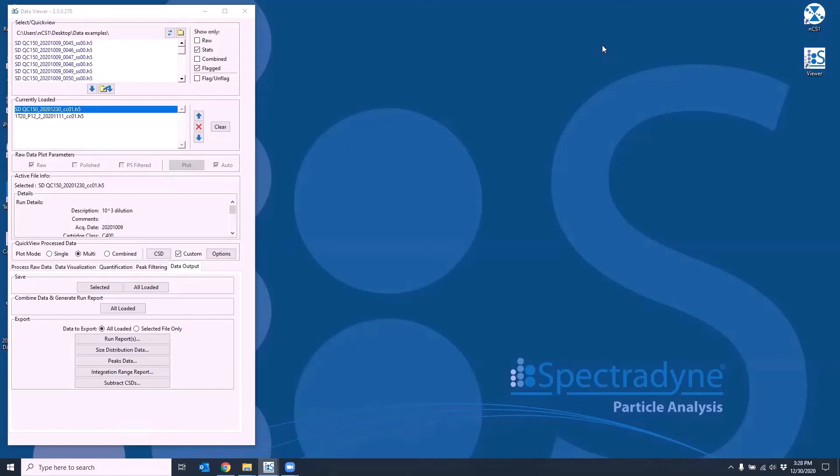The last option under export is subtract CSDs. This option allows for subtracting one CSD from another and this is very useful if we have a blank measurement that we want to subtract from the sample measurement.